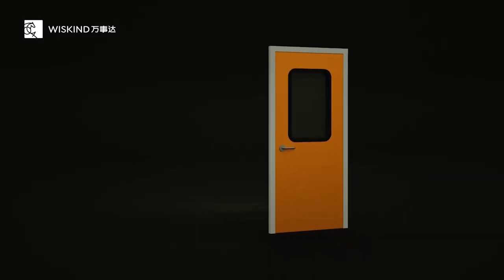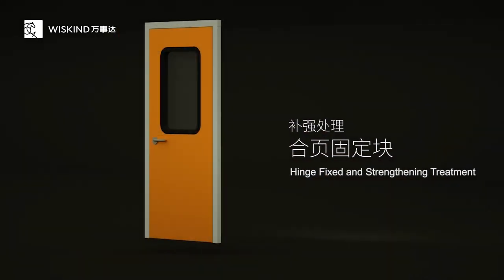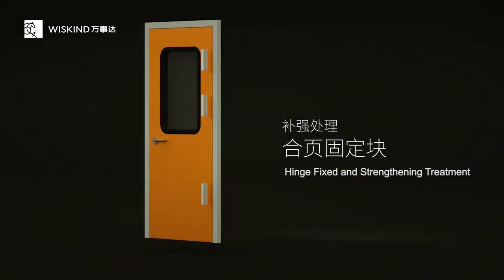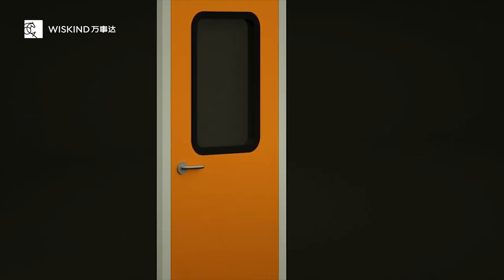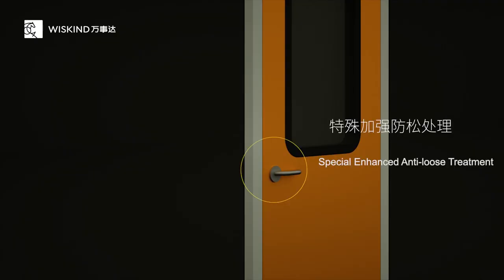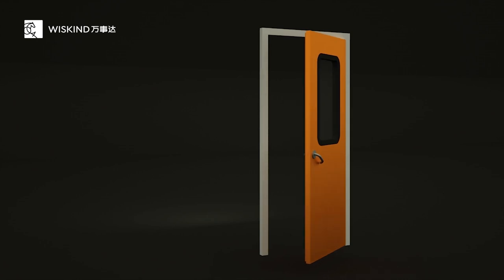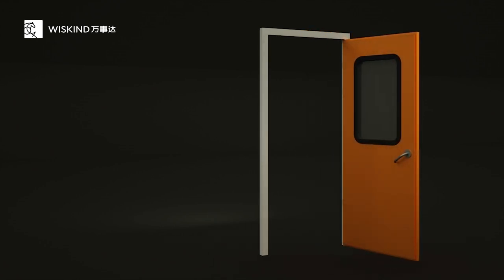Especially the reinforcement treatment at the hinge position greatly improves the fixed bearing capacity of the hinge. A reinforcement protective cover is preset at the lock installation position to fully protect the lock body. Special strengthened anti-loosening treatment is applied to make the lock body installation more reliable, and the handle will not become loose when the door is frequently opened and closed.